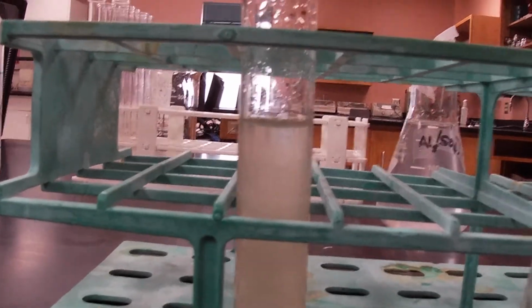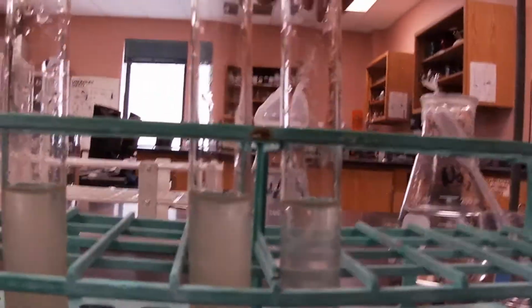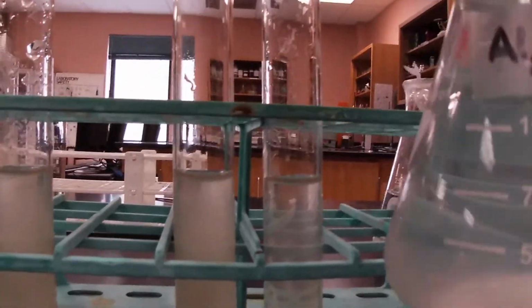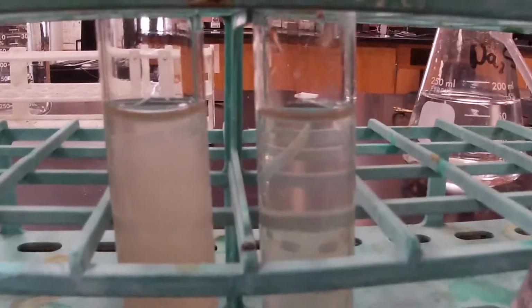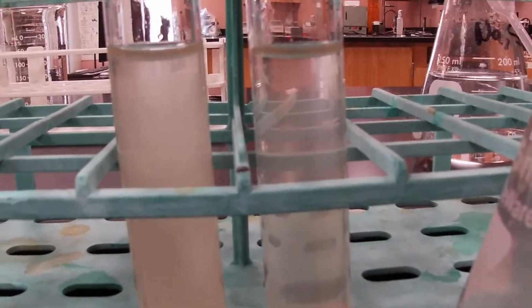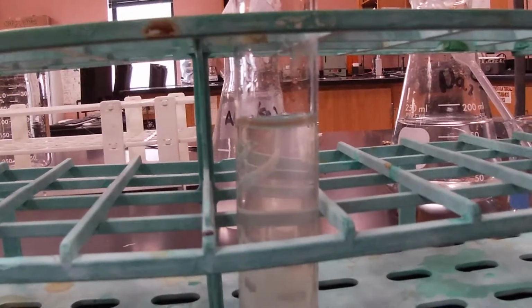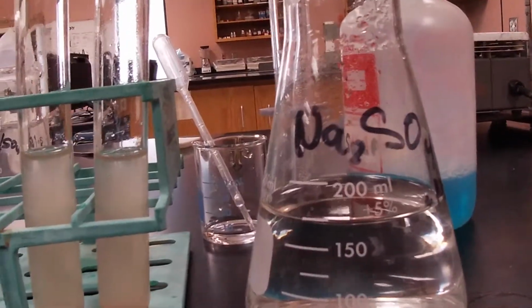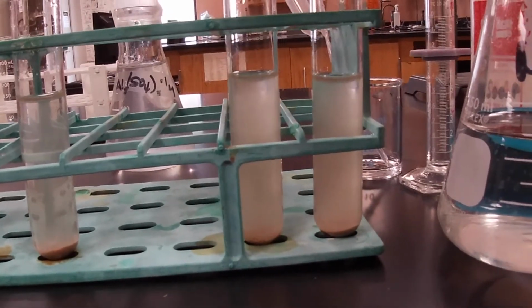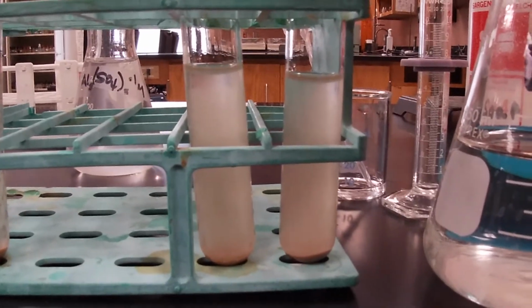So let's check out another solution. This is my solution of aluminum sulfate. As you can see, it does look a little clear, right? And then we're gonna go to the next one and test our standard here. Our standard for this one is gonna be our sodium sulfate solution. Here again, our sodium sulfate solution compared to our muddy water, our standard, looks approximately about the same.